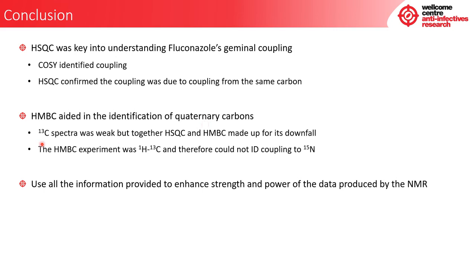You also notice as well that the carbon spectra was unbelievably weak. There was high background noise that you saw on it. However, the HSQC and the HMBC made up for this downfall. The HMBC was able to see those quaternary peaks, which are often very, very weak in a carbon spectra anyway. The HMBC, though, had another one of its downfalls.